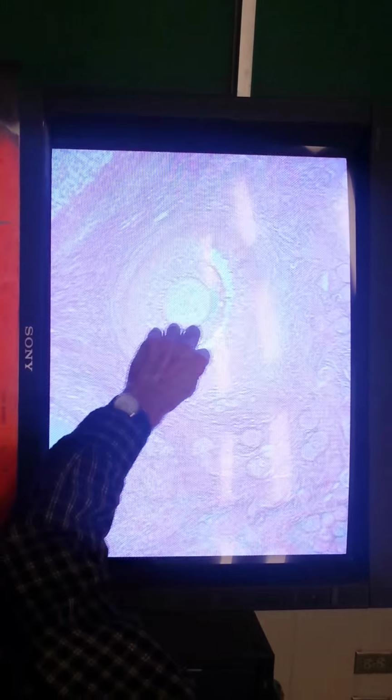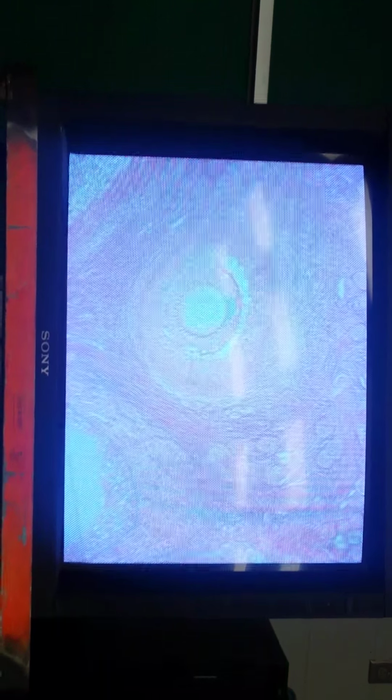Okay. And then what about this one? That is a secondary follicle. What makes it a secondary follicle? The spaces. What is that called? It is the antrum, or follicular cavity filled with follicular fluid. Secondary follicle and a Graafian follicle have an antrum. Primary and primordial do not. It's bigger than the primary was, but our oocyte is still in the center of it.